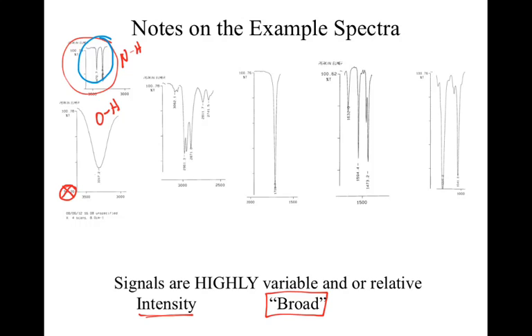Conversely, if you take a look at the OH in the Sapling homework, there's at least one problem in the Sapling homework that shows OHs that are very, very narrow. Well, that OH can get narrower if there's minimal hydrogen bonding. How do you know if there's hydrogen bonding or not? How broad is the peak? There really isn't anything beyond that.